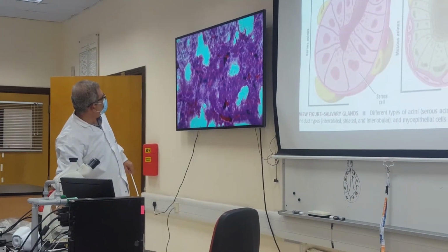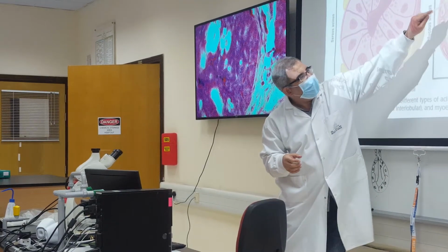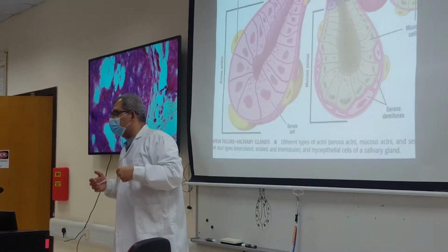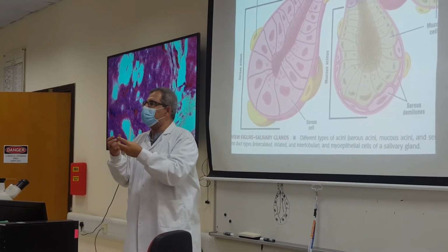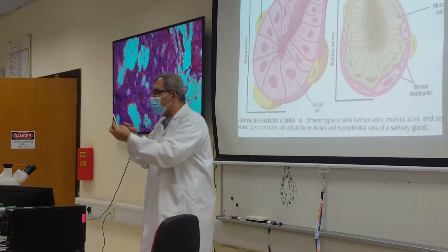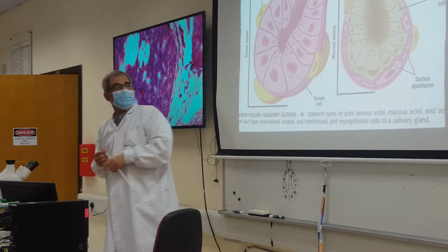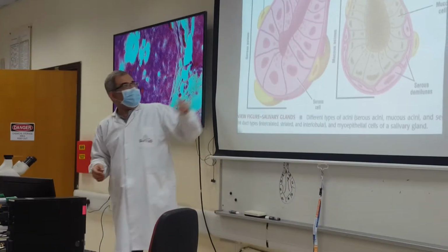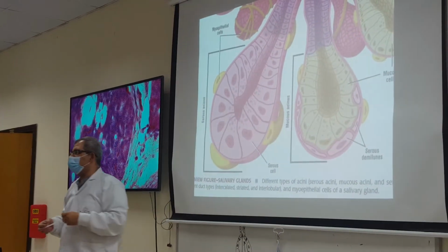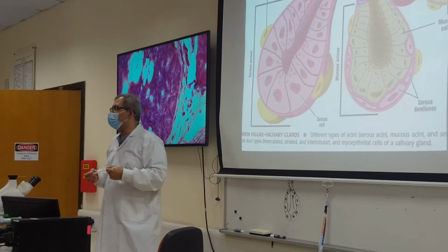So while you are looking at these ones, imagine that your salivary glands, they are like this. واضح? Even when you check your saliva, it got secretions. Part of them, there is some mucus. Okay? So these ones, they are mucus acinus. Whereas the other cells, they secrete the other secretions. Several cells with the saliva, maybe enzymes.